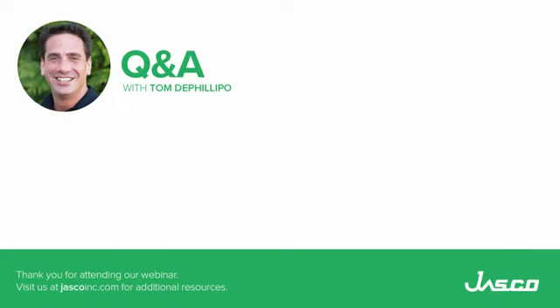Okay, so you mentioned that the CD detector is only made by Jasco. Does that mean it can only be used with the Jasco system? No, we have many customers that use this detector on their Agilent systems or Waters systems, whatever type of system you may have. With one side note: you can import the signal to most HPLC detectors that have that ability, but you will not be able to scan CD wavelengths.